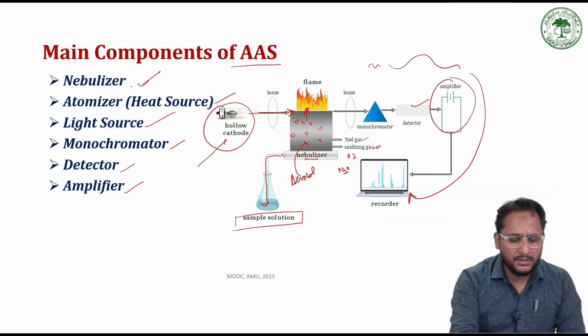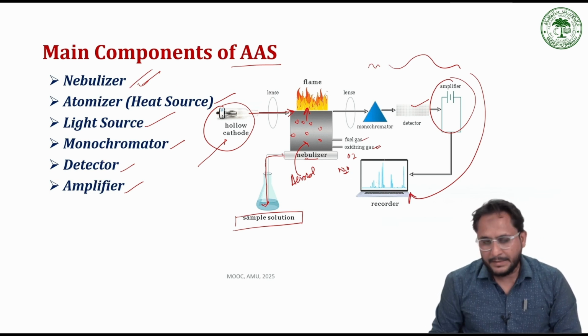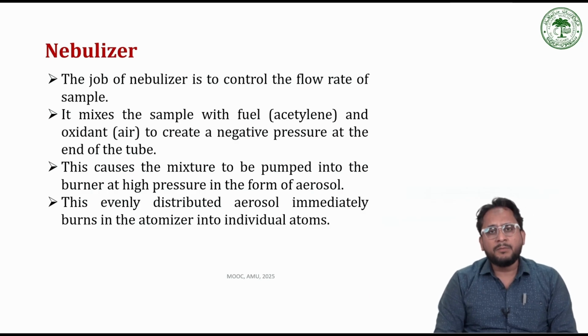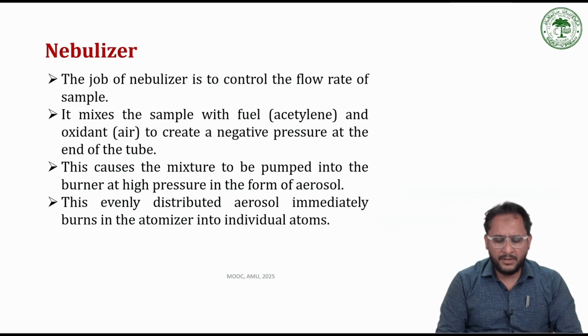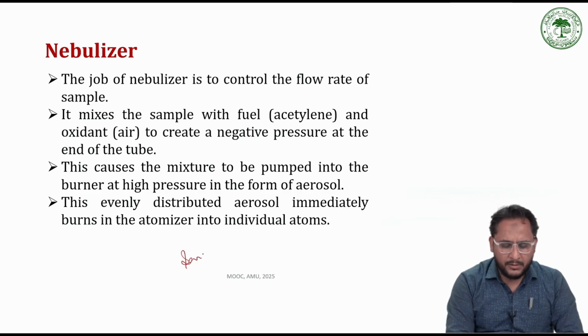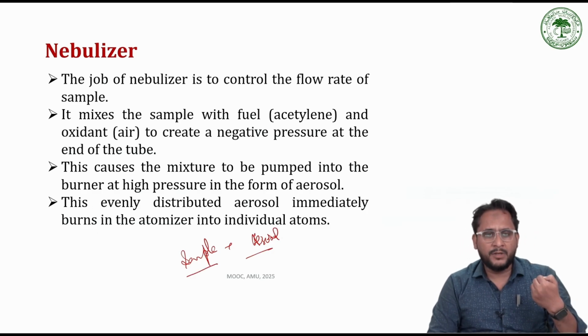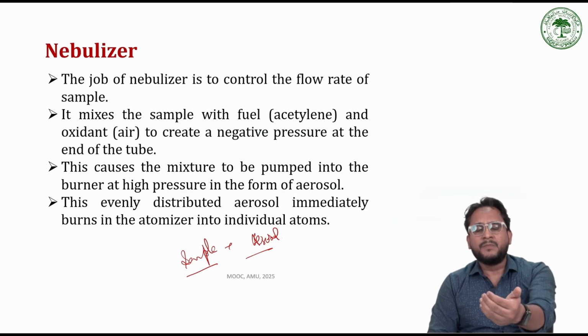Now we'll individually discuss all these components in detail. So the nebulizer, as I said, converts the sample into an aerosol. A liquid sample is converted into an aerosol with the help of this nebulizer. This nebulizer also controls the flow of the sample into the atomizer.